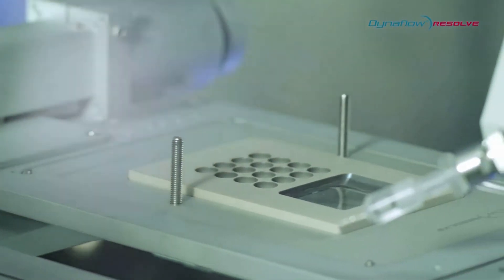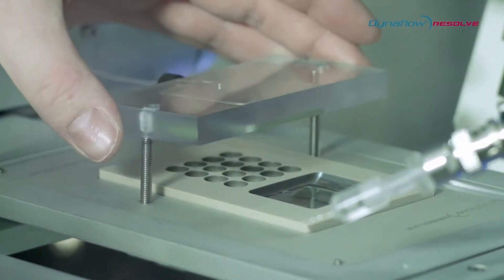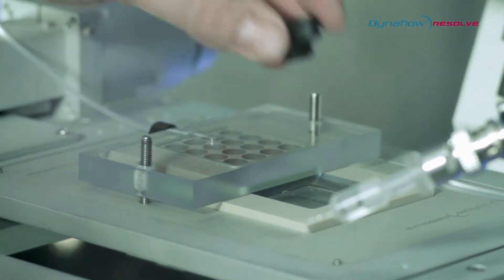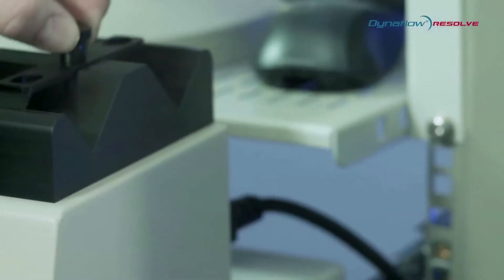The chip is mounted in the chip socket and sealed with the lid. During the experiment, the flow in the chip is regulated automatically by the pump.